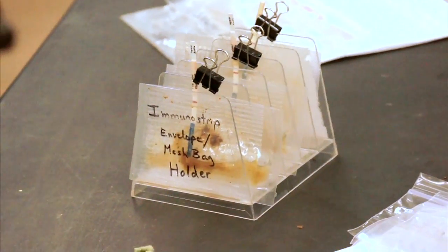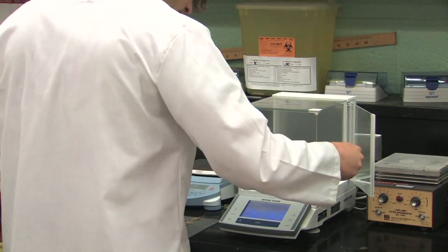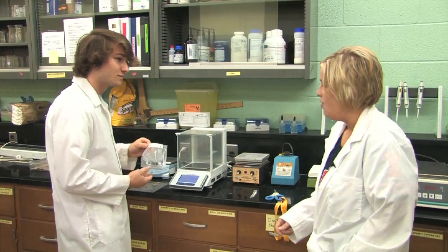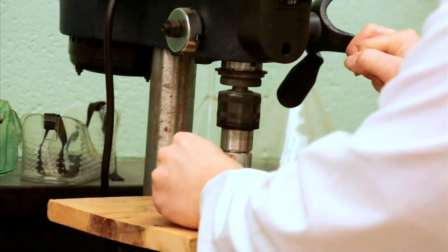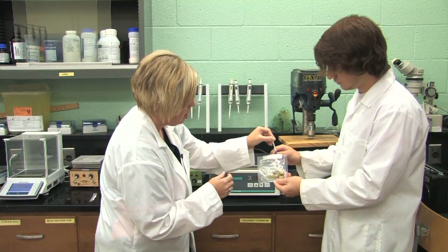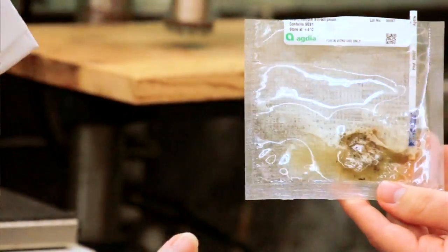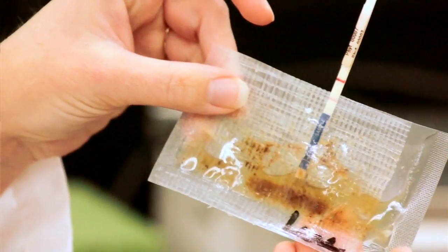We are lucky enough to have these quick strip tests from Agdea. We're going to take some of the tissue that looks symptomatic and weigh 0.015 grams of this material out. We're going to try to grind up the material inside one of these mesh-filled bags. Then we take one of these test strips and stick it down into the liquid. Let it incubate for about 20 minutes, and two lines means it's positive.